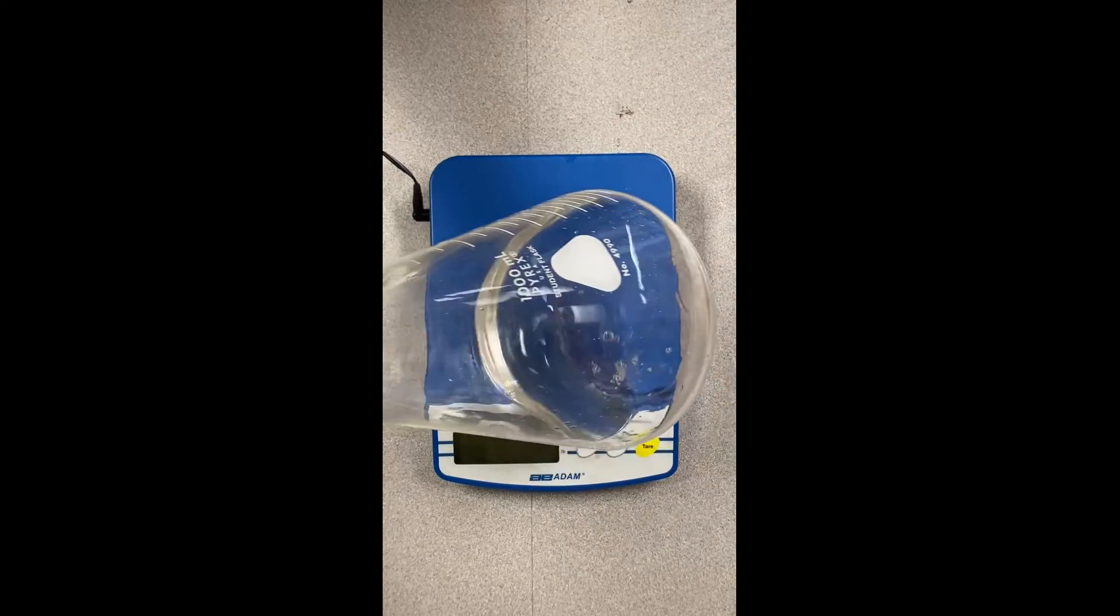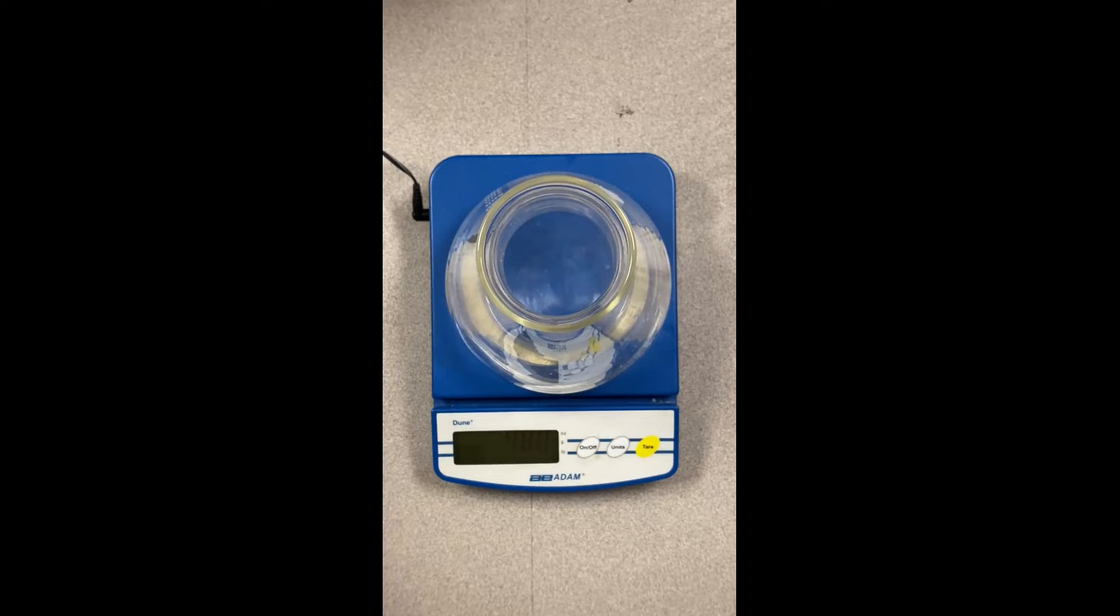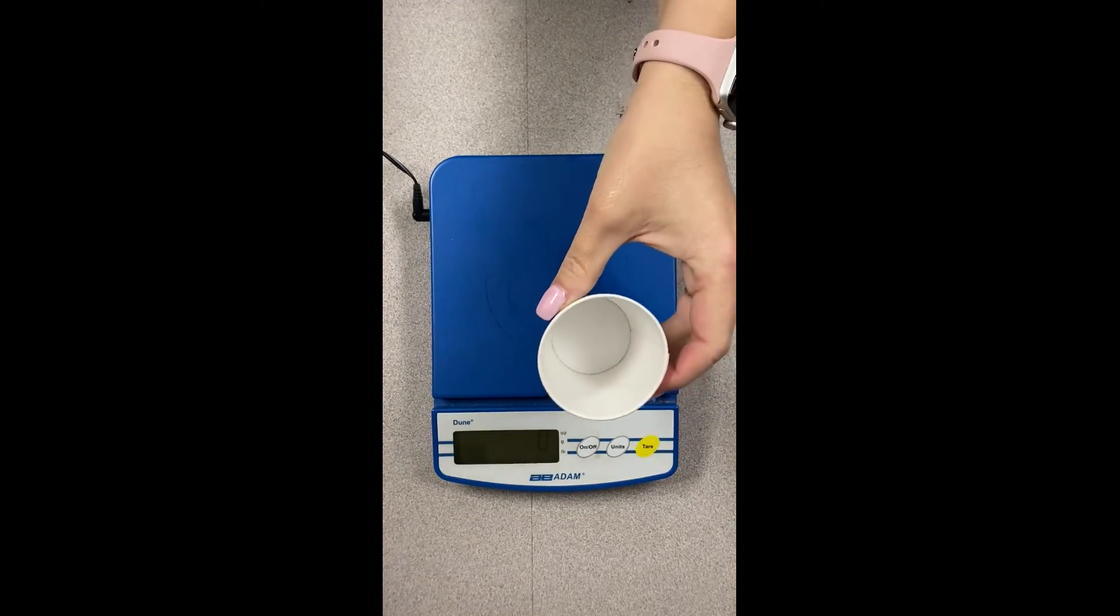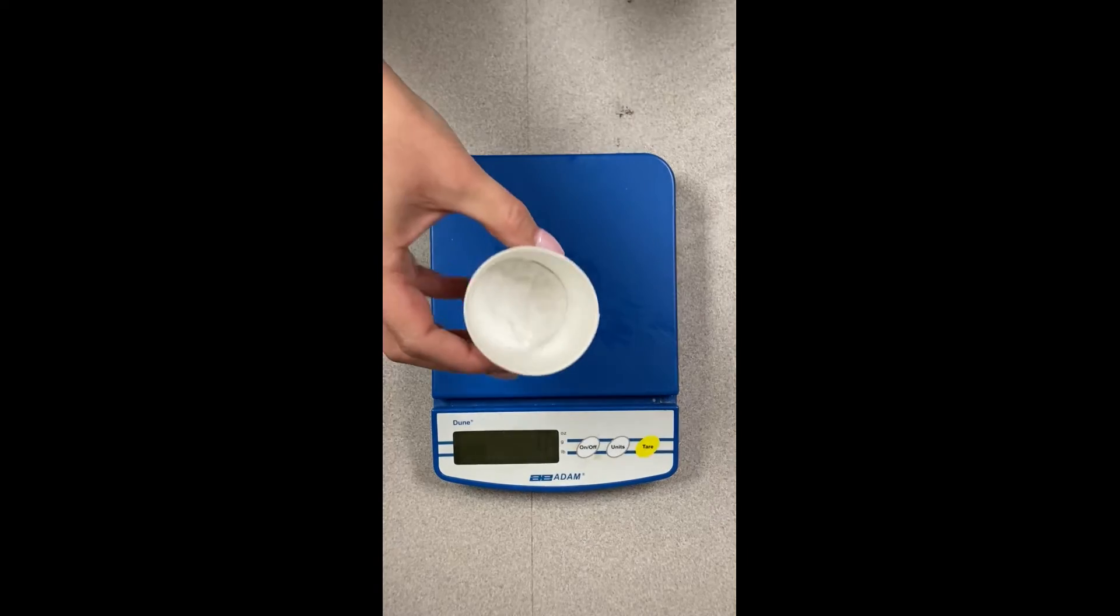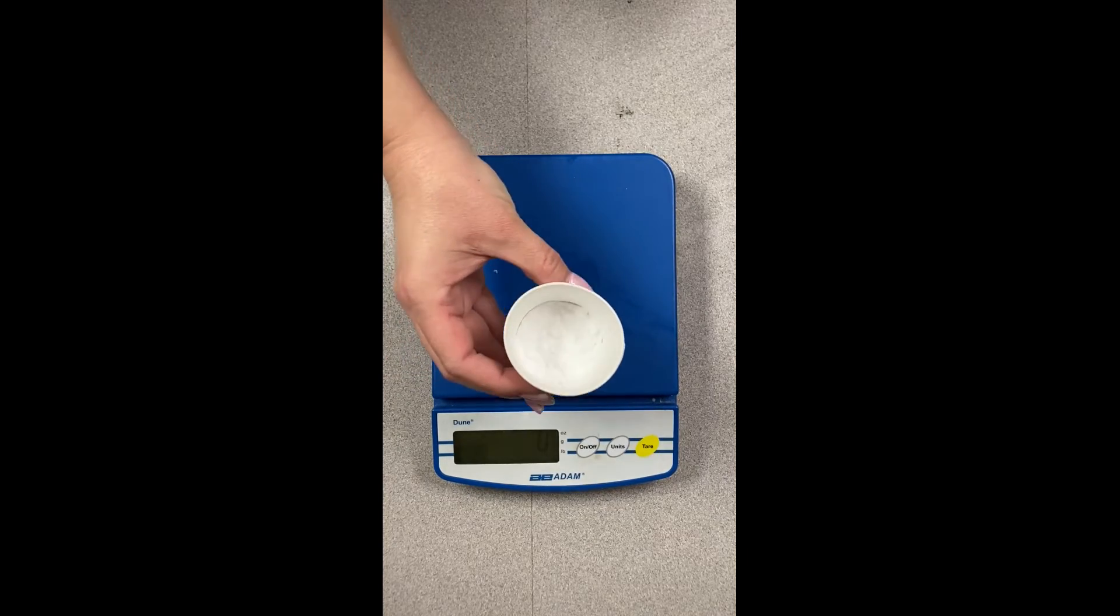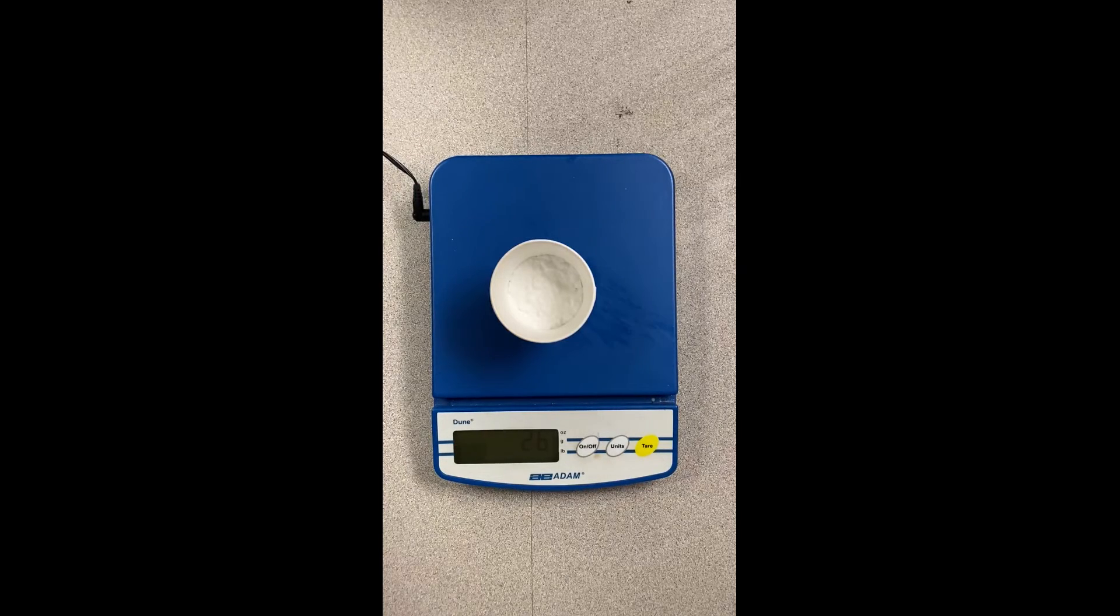All right, we're going to go ahead and start our mass measurements for our flask and vinegar and you can see that comes out to 480 grams. Now we're going to go ahead and measure a cup. This is just an empty cup and that comes to two grams. We're going to go ahead and put baking soda in that cup and take the measurement of mass again and you can see that is 26 grams.